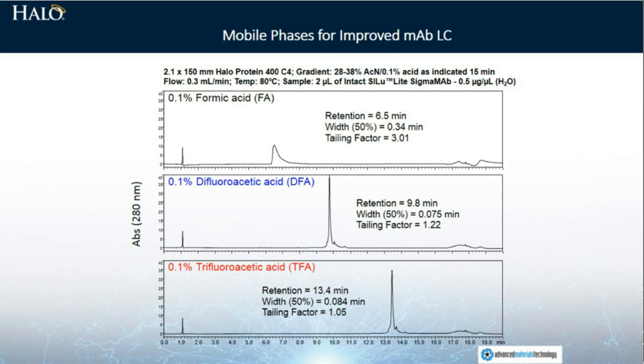Now, in reality, the electrospray ionization is not tenfold different, better than what you get with trifluoroacetic acid. So formic acid absolutely is still the best to support high efficiency ionization in electrospray for mass spectrometry, but DFA is clearly a little bit better than TFA, and as I said, has a number of convenient features, not the least of which is we can get rid of it quickly.